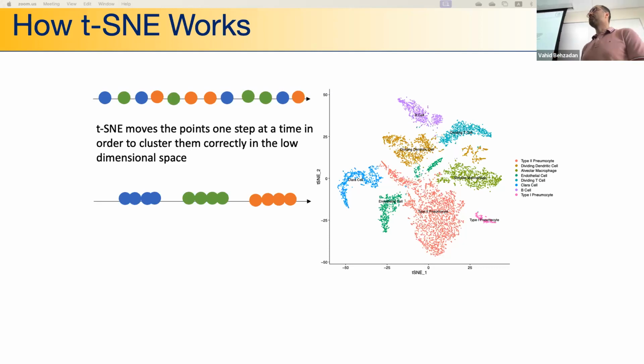The process that you described was already based on the assumption that having the same gene expression signature is going to result in the same type of protein production. Is that assumption used in making the clustering more fine-grained in an adaptive feedback loop? It's not an assumption. Basically, you can't get two cells that are exactly the same in terms of gene expression, especially in a low dimensional projection, right?